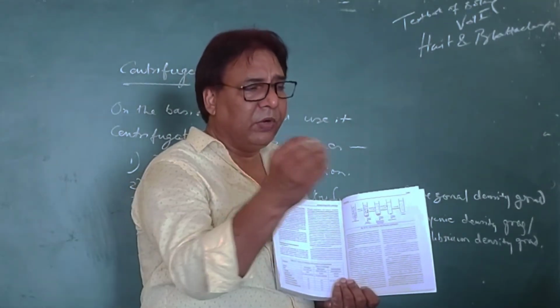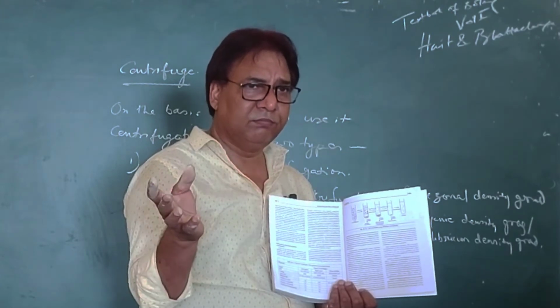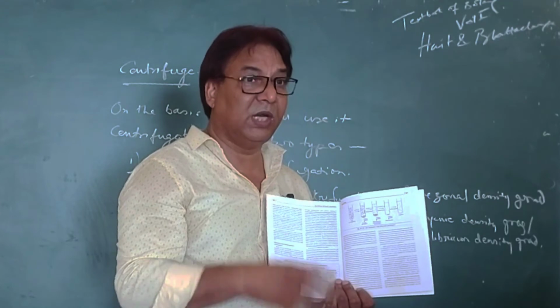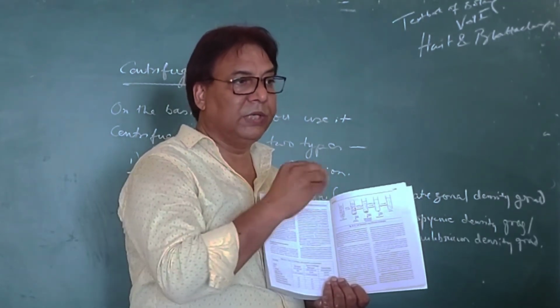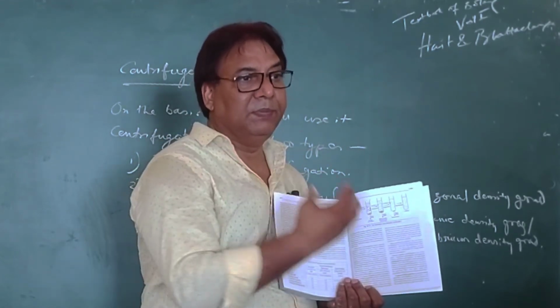with the nucleus. So if your work is with nucleus, maybe you are doing a run-on assay. It is an experiment in which we label the nucleotides, the RNA, inside the nucleus, and then we do an autorad.